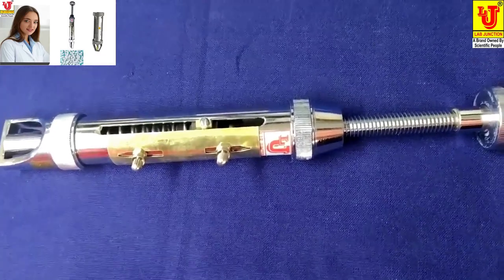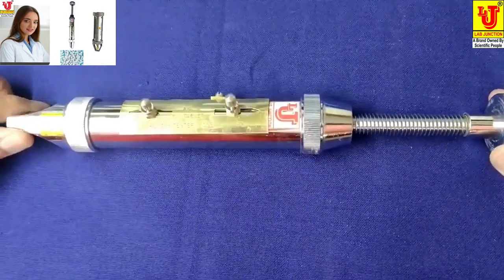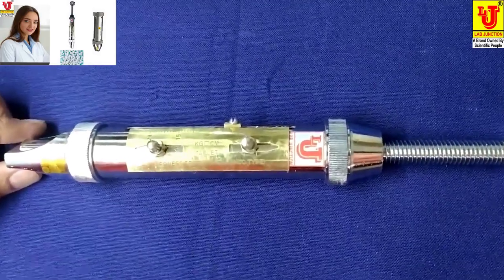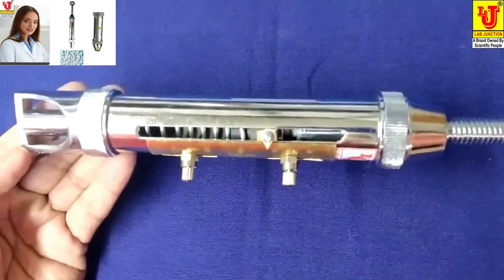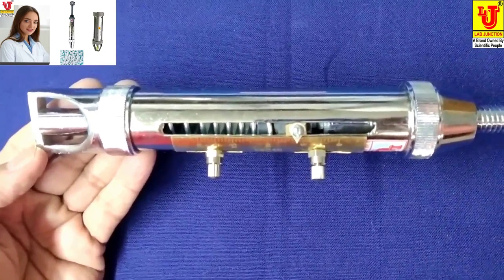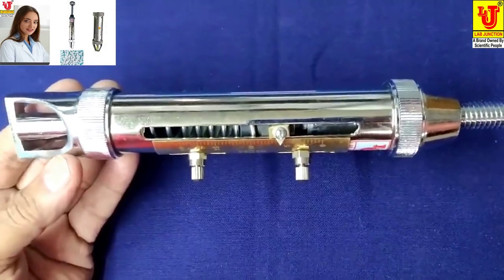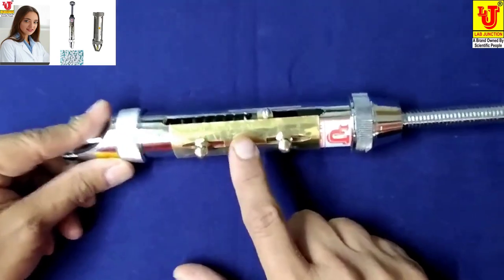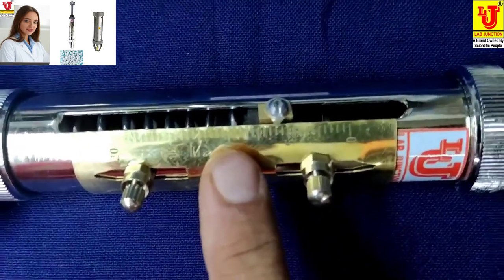How to use this hardness tester — tablet hardness tester, Monsanto type. When we force the pressure to the tablet to crush, the scale gives the reading in kg.